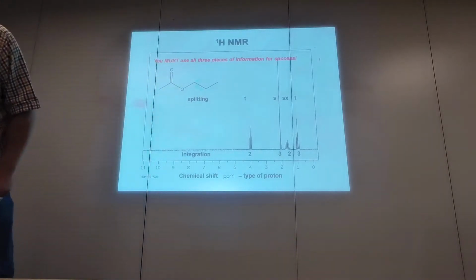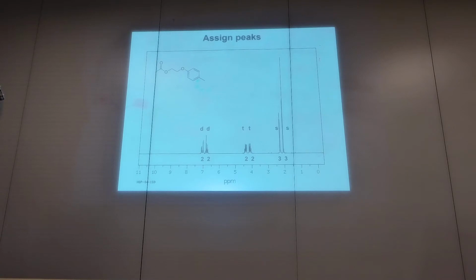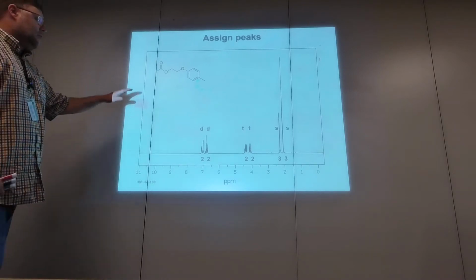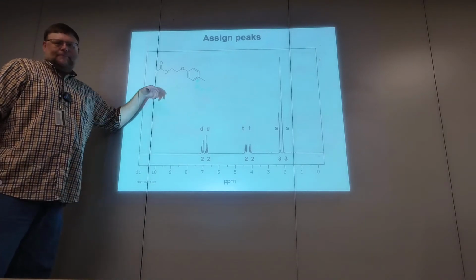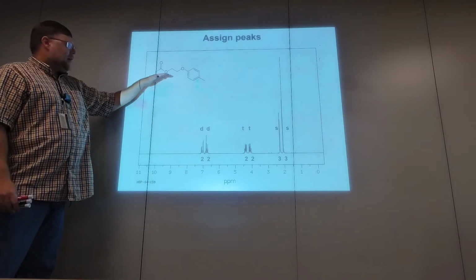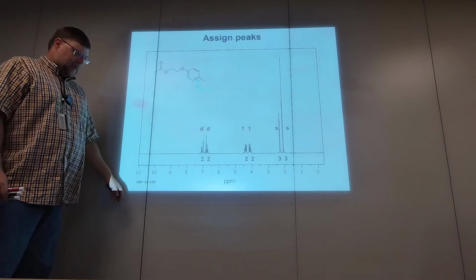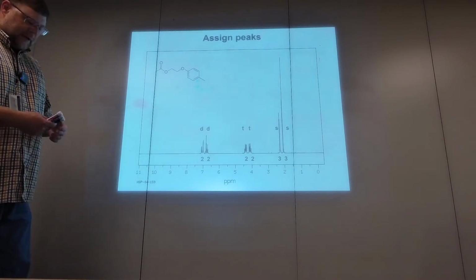Okay, so let's go back to the original molecule. This is the original molecule I put up a couple of videos ago. So again, hit pause, figure out where the protons are in this molecule, and then assign them to a peak in the proton NMR spectrum.